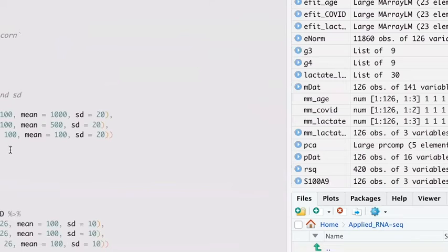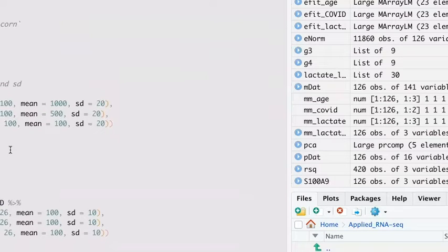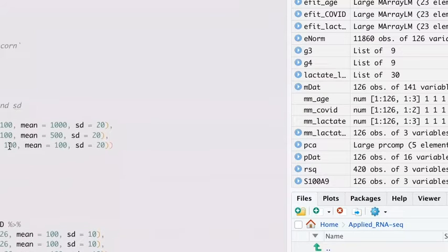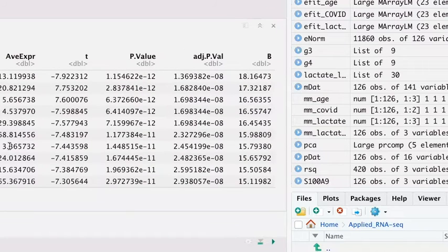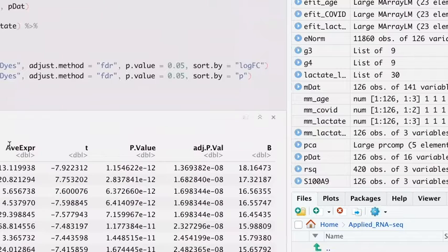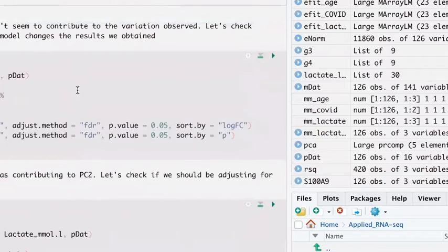Okay, and so now there's actually, I think we're running quite ahead of time, but that's good. Could you go back to the top table? So it's looking at just S100. Yes. So that would be here.